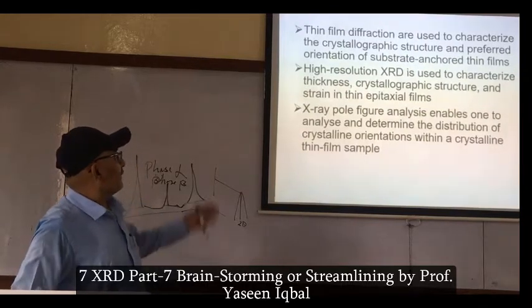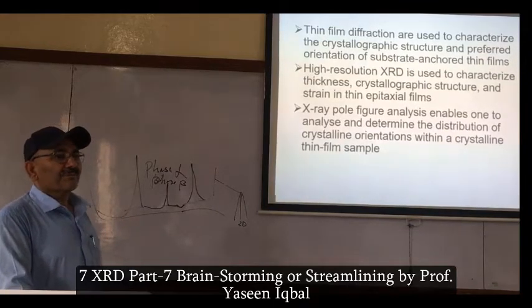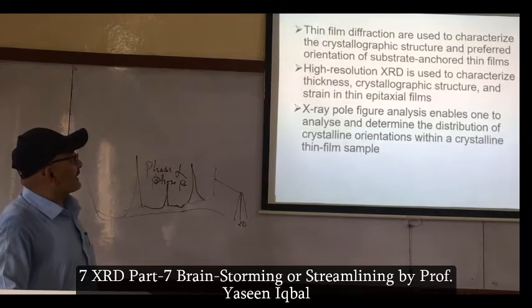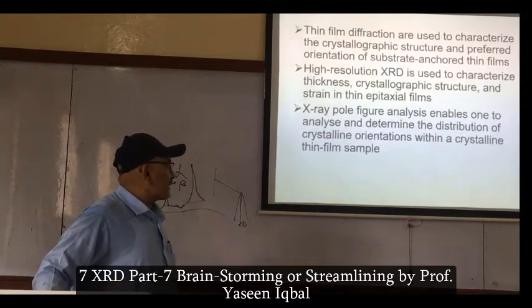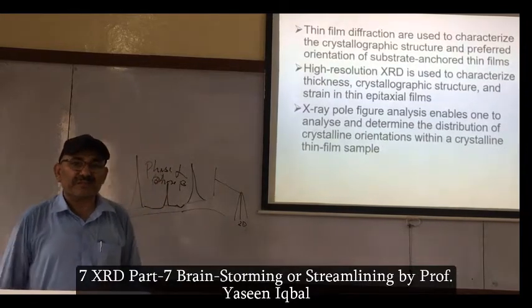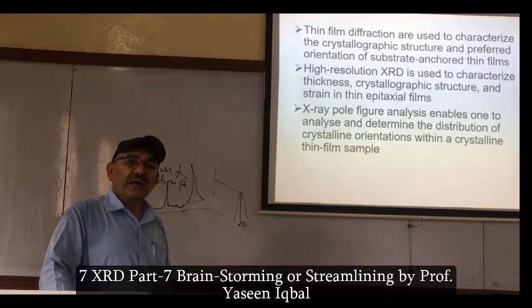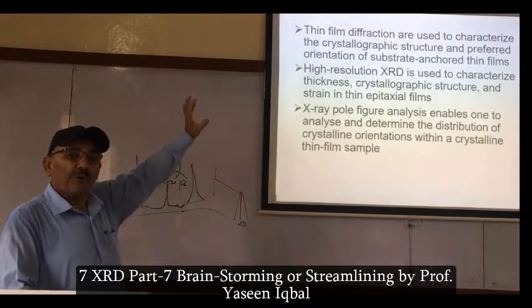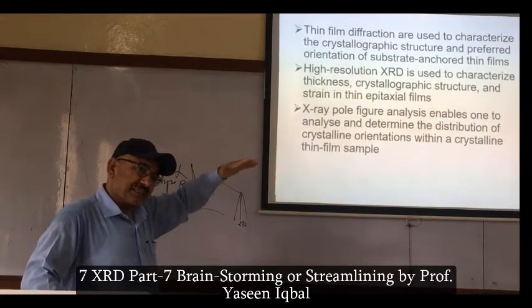Thin film diffraction is used, not are, is used, to characterize the crystallographic structure and preferred orientation of substrate anchored thin films. When you are making thin films, you can determine the orientation of the crystallographic surface, the preferred orientation of the material, along which plane these crystals are there.